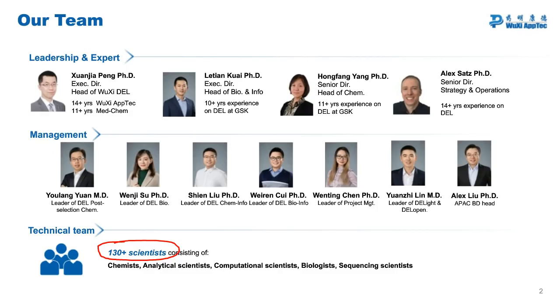Do you identify and share information on promiscuous binders that interact with a lot of different proteins non-specifically? So as we run more and more screens, we keep a database of everything that enriches against every other target. And what we generally do, as time goes by, is we choose to ignore things that enrich against multiple targets. Do we share that information? No, we didn't have any intention of sharing it, but we do flag that. So we don't want to suggest that people follow up a potential hit which we see enriched against a lot of other structures.